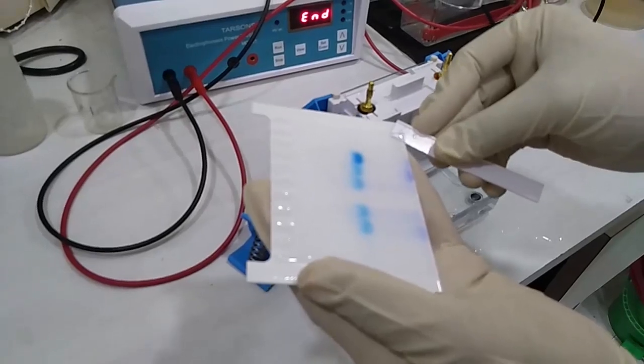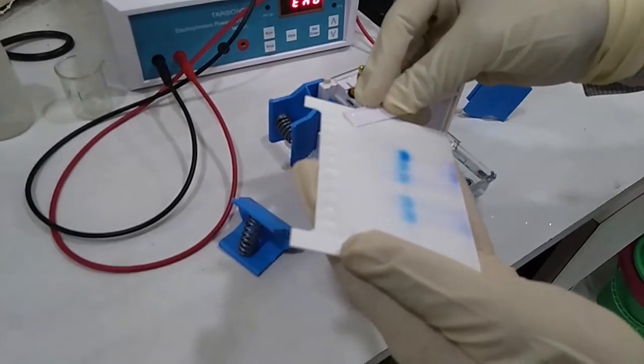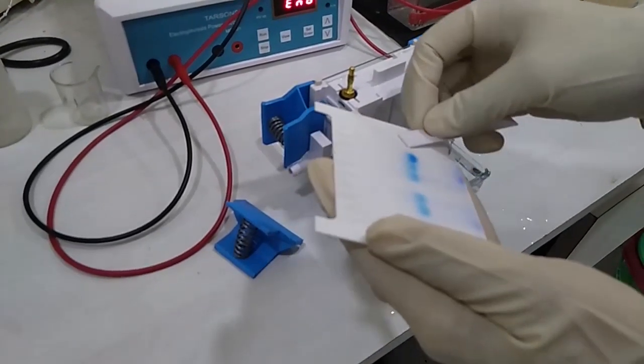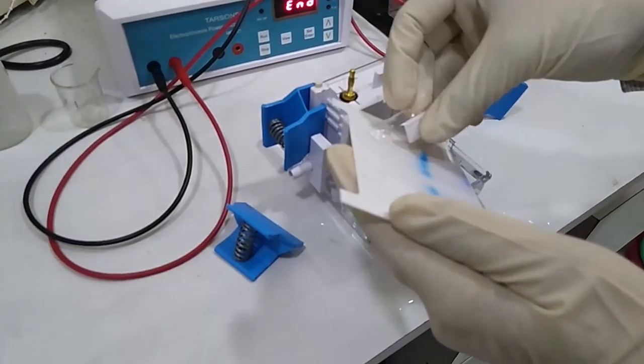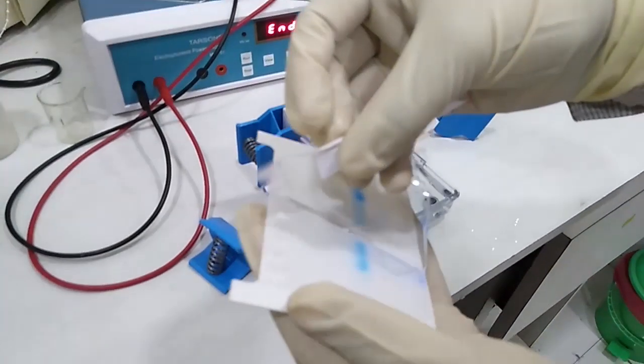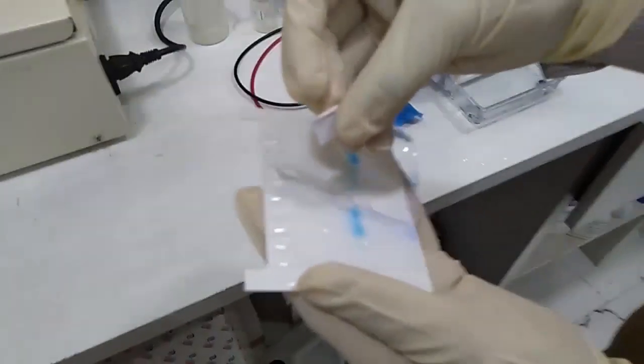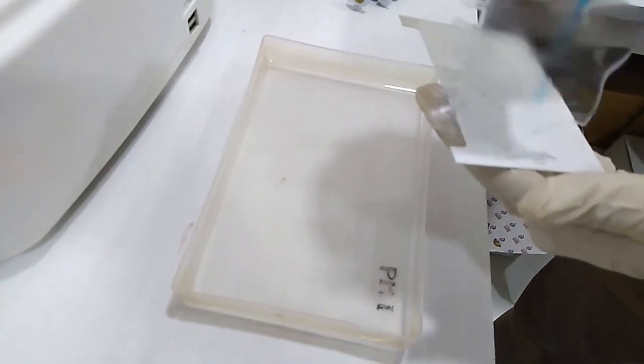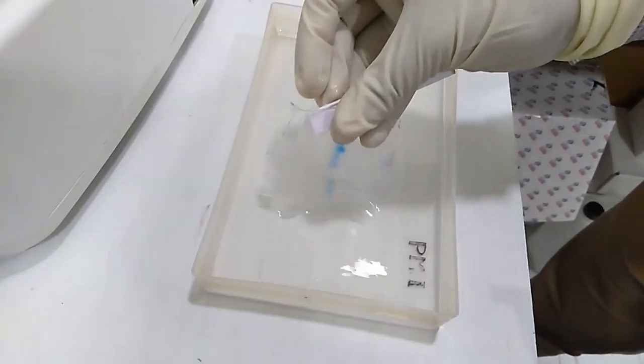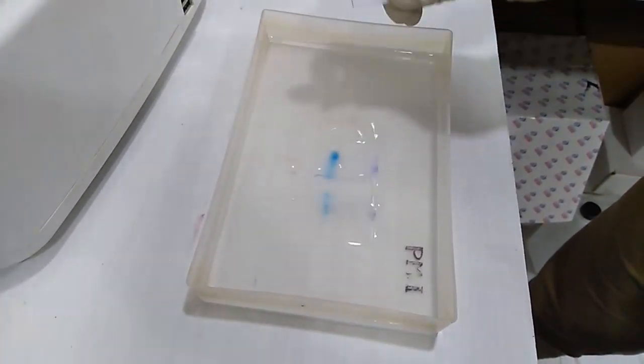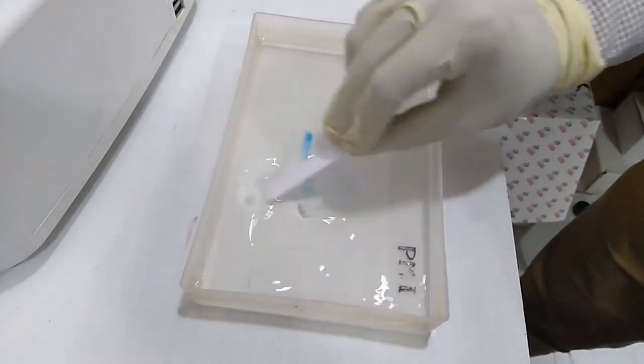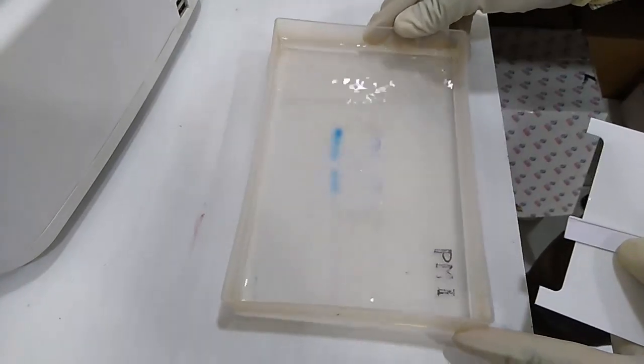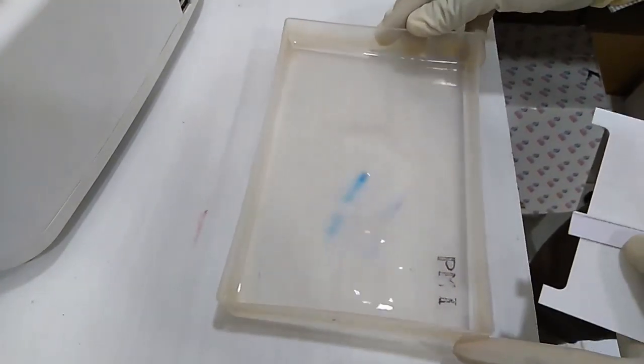We need to detach it from the slide by the spreader. Now we have to take it smoothly that there will be no damage. And we need to give it into the ethidium bromide solution we prepared. And make sure that it all be stained well.